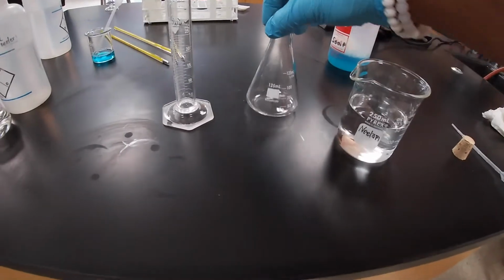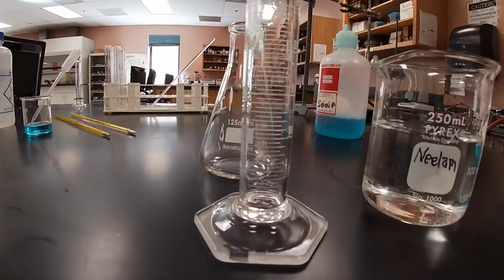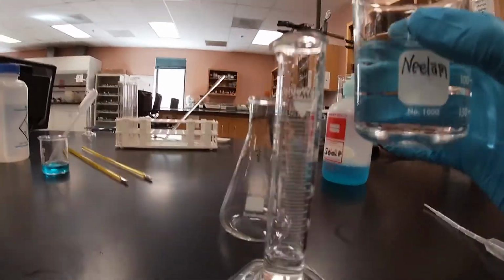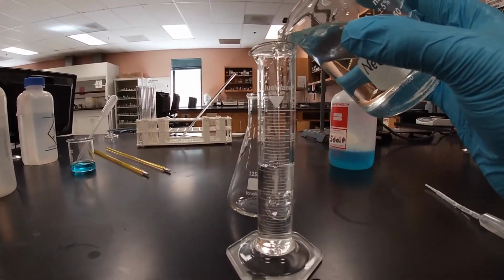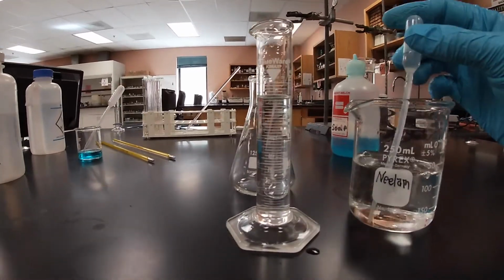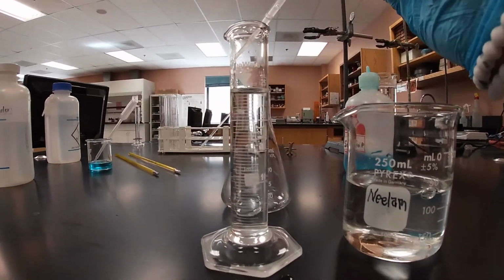Here we have our tap water. We have the other Erlenmeyer flask. And here we're going to add, again, the 25 milliliters. This is our tap water from the lab, and we're going to determine the hardness. So we got really close to it. And then we're going to pipette from here so that we can get 25 milliliters, and then we'll have to do this again because we need 50 milliliters from this sample as well.